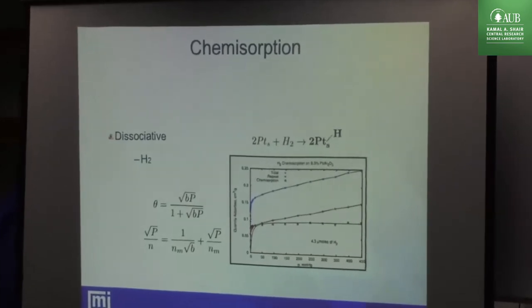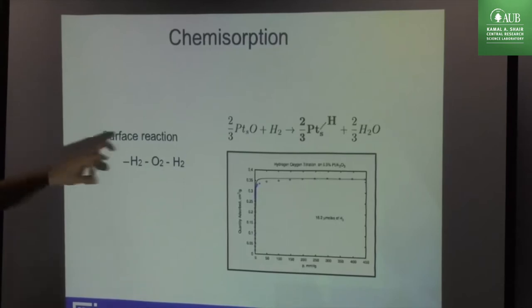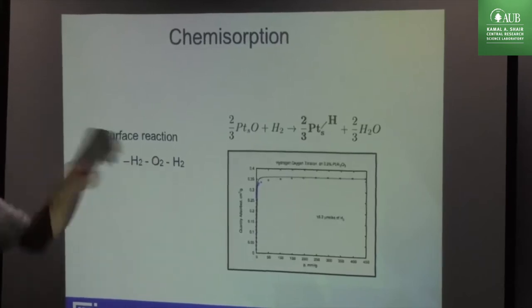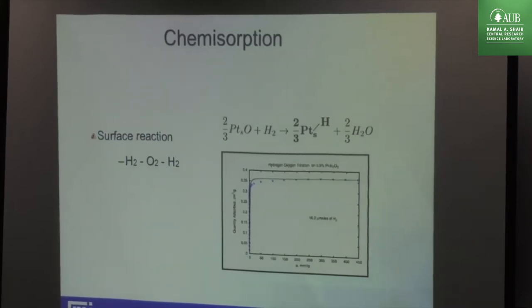That is due to the dissociation of the hydrogen molecule. Or you can have hydrogen oxidation, a surface reaction, hydrogen-oxygen titration. As you work in the field of catalysis, you need to deal with these three equations very, very well: CO, hydrogen, and hydrogen-oxygen titration.